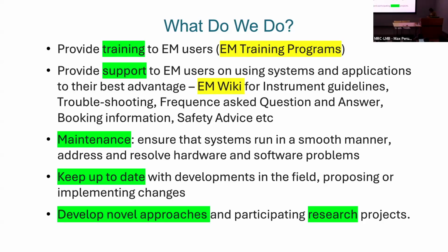It also has a troubleshooting page, added in the last 2 years, which is very useful. So you don't need to call us at midnight saying, what do I do? Look at it first. Usually you'll see the answer. But of course, some of our people do answer 24 hours. Okay, then maintenance: make sure everything is working, and update new microscopes.